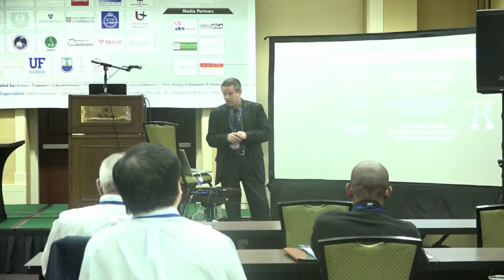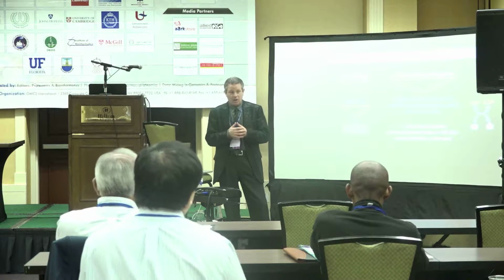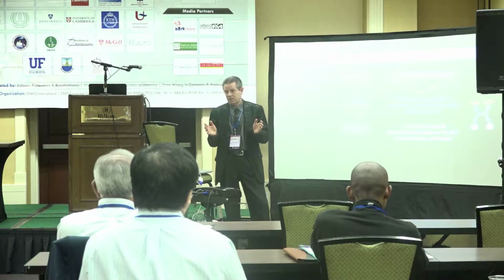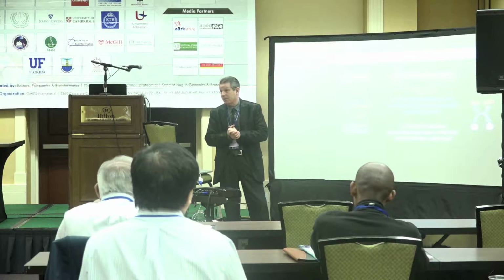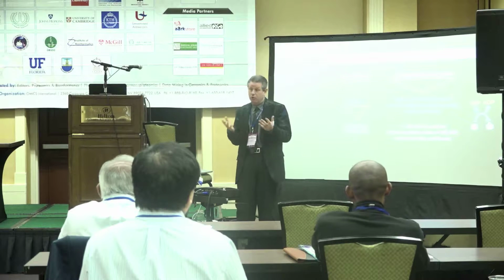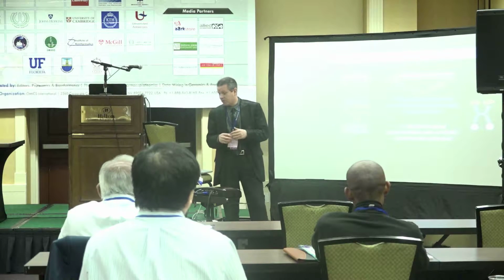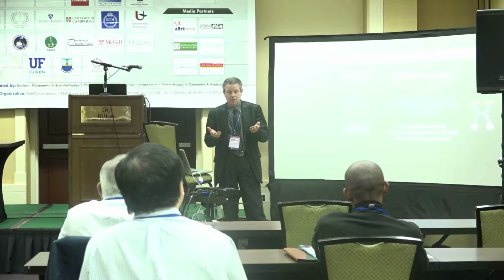So with these phosphorylation sites, when you look at PhosphoSitePlus by mass spec, I would say about 98% of those phosphorylation sites have only been described once or twice. Very few of them do you see, like the MAP kinase, with over 2,000 reports of phosphorylation of the T and the Y, the threonine 202 and tyrosine 204 in ERK1, for example. So most of the phosphorylations, when you go by mass spec, it's a powerful tool. You can detect these, you can discover novel sites. It's very hard to track them from sample to sample.